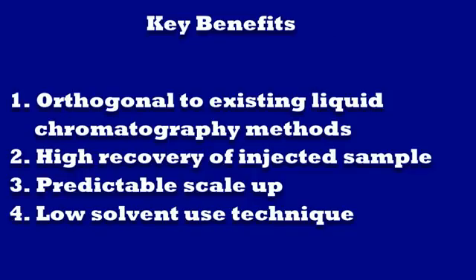In conclusion, liquid-liquid chromatography can bring you new capabilities. Although it is a standalone technique, it is complementary to other liquid chromatography methods rather than a replacement. It adds a new dimension to your chromatography toolbox.